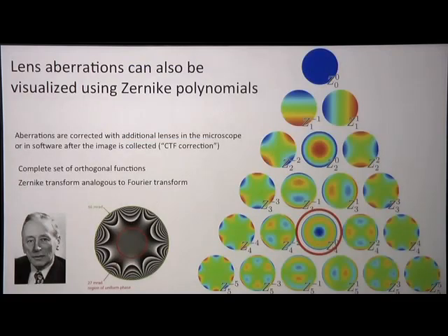Okay, I'm just going to briefly mention one more of these because they're important. This one here is one we talk about a lot. It's spherical aberration, CS. And this is a parameter that you have to put into RELION every time you do a calculation. And it's a good idea to know where this comes from.